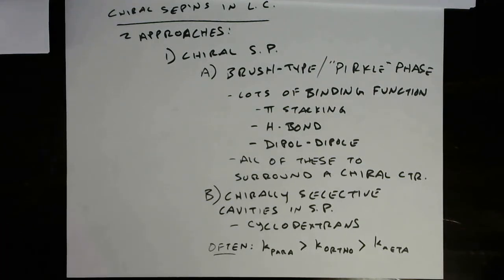And actually that's the theme that we haven't really gotten to yet in these chiral separations, is that they're really hard. They're really hard methods to develop if you want to try and make chiral separations work. And so you get these little rules of thumb like this, but really it's going to be a lot of method development to figure out exactly how things are going to bind and when things are going to bind and what's the right stationary phase. Here's something else we can talk about.